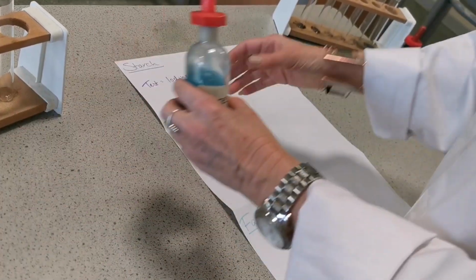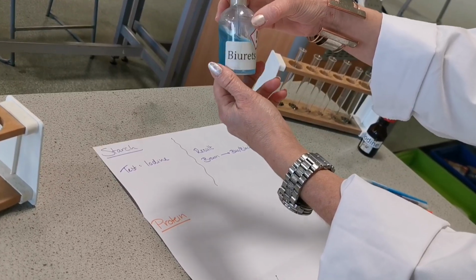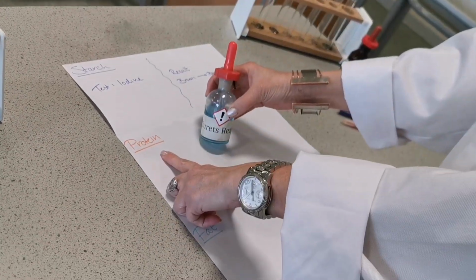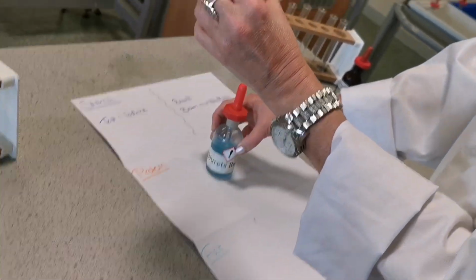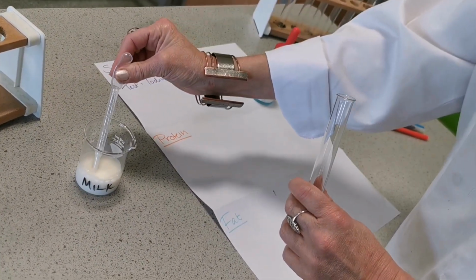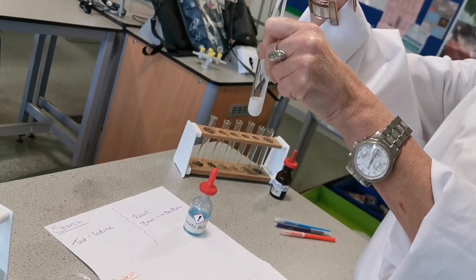We are now moving on to biuret. So as you can see, this is a blue, fairly clear liquid. Obviously we are dealing with chemicals here, so we do have to be careful. And this is going to be our test for protein. So we are going to be testing some milk, everyday milk, and we are going to first of all take a test tube. We are then going to add a few drops to our test tube of milk.